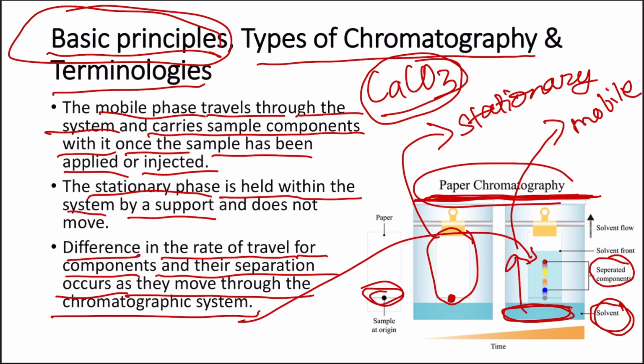In the case of paper chromatography, it is basically a blotting type of pattern, but in column chromatography you can see bands. There are also different types of chromatography where you will get a different pattern, and this will be interpreted later. If we connect the chromatographic system with a detector, we can detect the components in the form of peaks. I will be discussing that later.